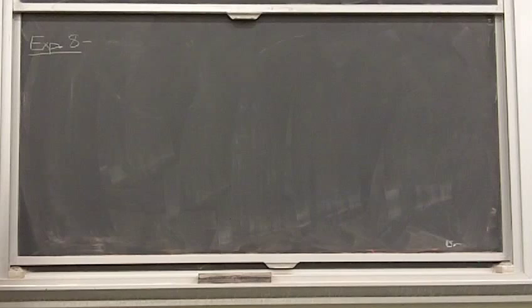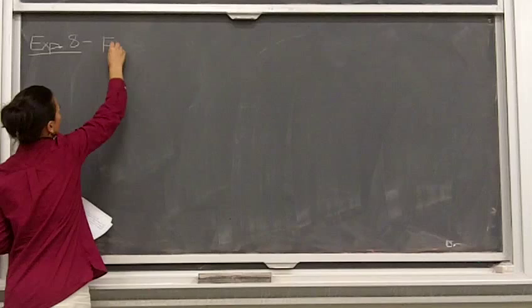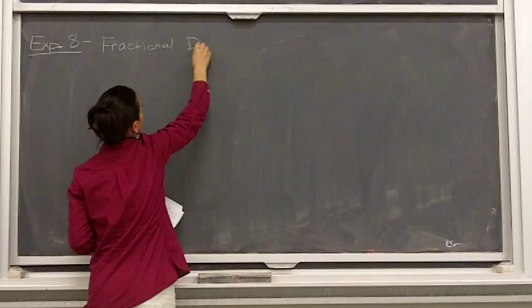If you are doing that in an open lab time, make sure you let your lab prof know when you're in lab, and also make sure you have a buddy to help you out and make sure that you're safe while you are in lab, okay? So what you should be starting with in lab this week, if you didn't complete it last week, is the fractional distillation to purify your alcohol.